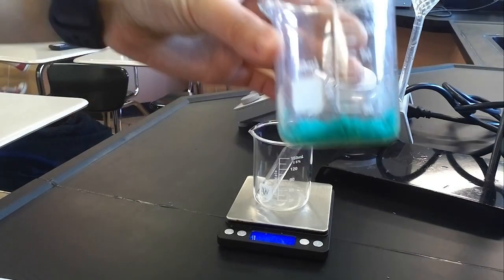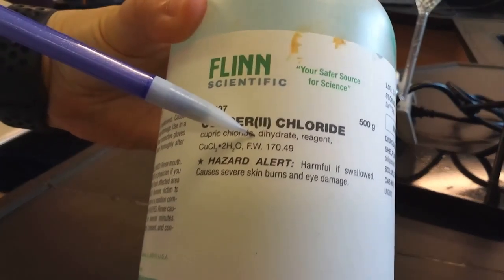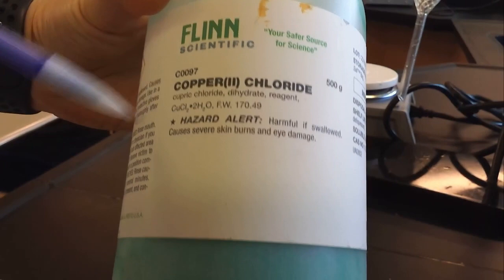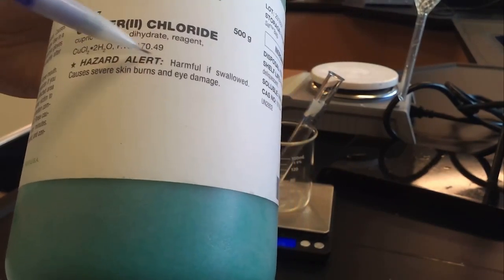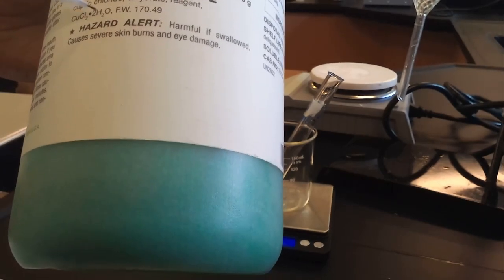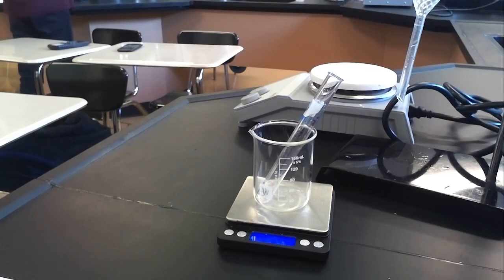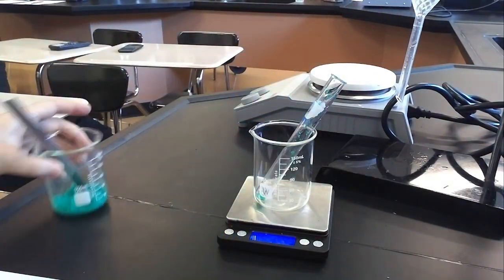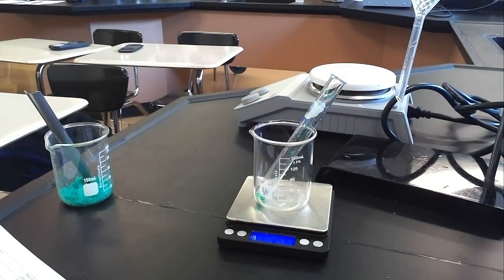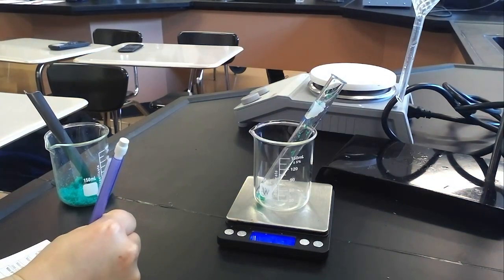The copper chloride dihydrate comes from this beaker. 'Dihydrate' means it is the copper chloride salt that, in its solid form, is bonded to two water molecules. When you take the formula weight (molar mass), you have to account for those water molecules bonded to the copper chloride. For us, the water becomes part of the solution and doesn't affect the actual reaction. I ended up with 0.31 grams, so I record that mass of solid copper chloride dihydrate in step three.